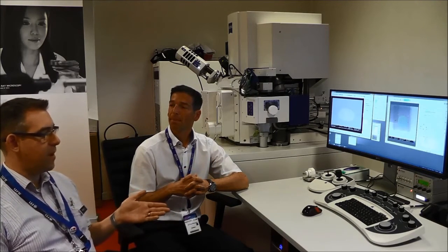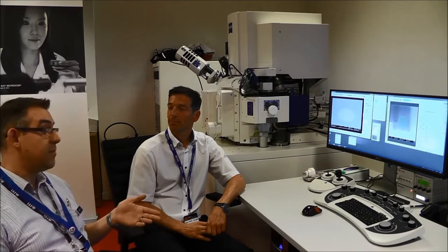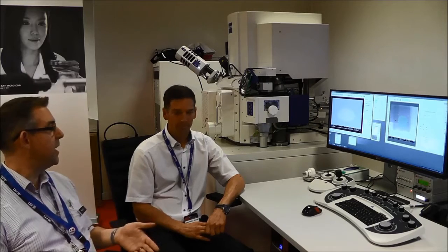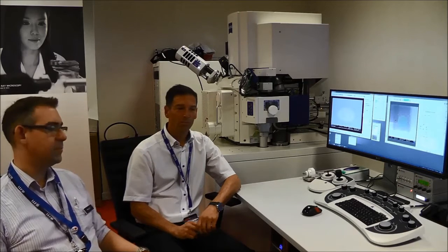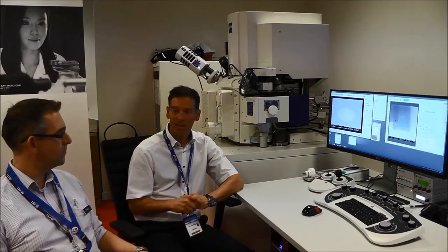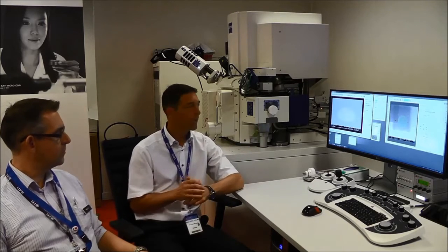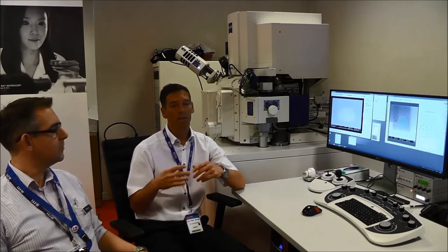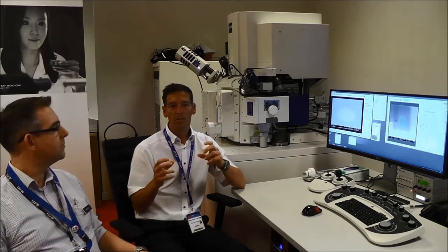These instruments are expensive and they need to be made to work as effectively and efficiently as possible. How does the technology you offer allow the user to do that? When developing our CrossBeam platform we focus on highest productivity and highest throughput. One aspect that helps you obtain results quickly is the live imaging capability — you start a milling process and image live what you're doing, already tuning the SEM beam to take the final image shot after the process has finished.